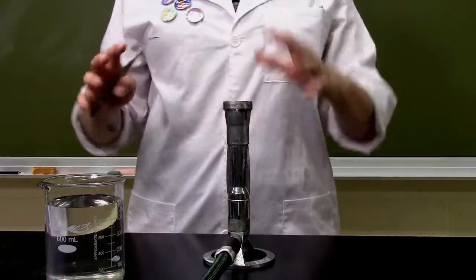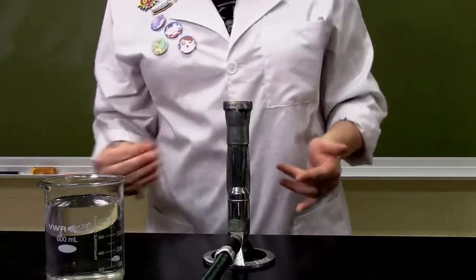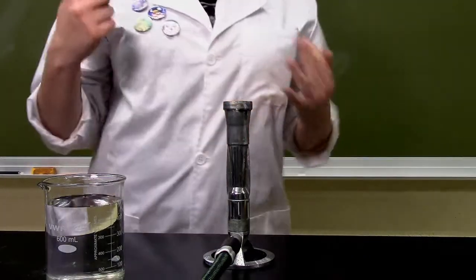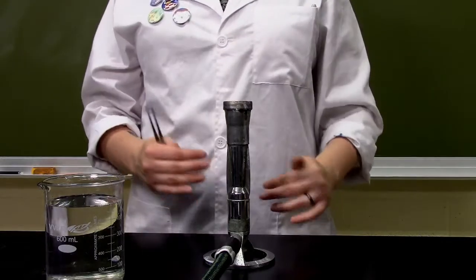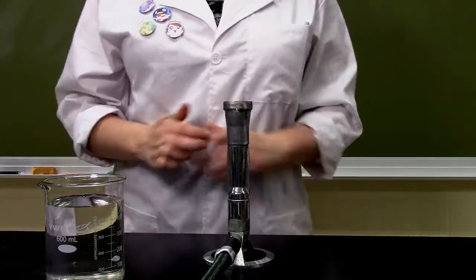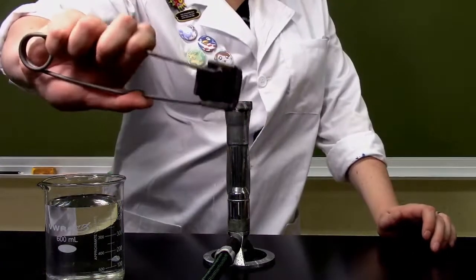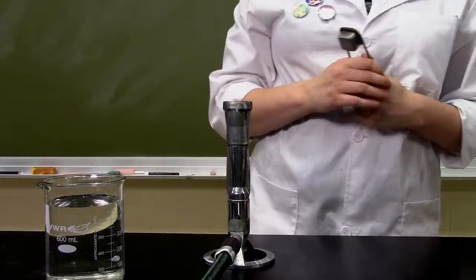My workstation is clean. I know where everything is. And y'all, when I light this Bunsen burner, I know where the fire extinguisher is, where the gas shutoff valve is. So I'm aware of all of the safety components before I even work with the Bunsen burner. Okie dokes. I have my sparker here, and I'm going to turn on the gas and light the Bunsen burner.